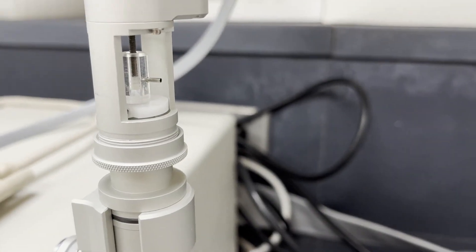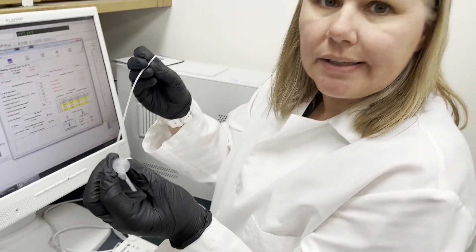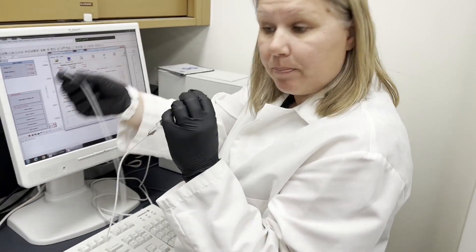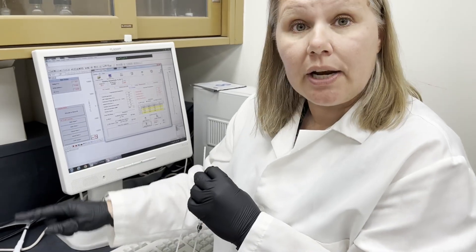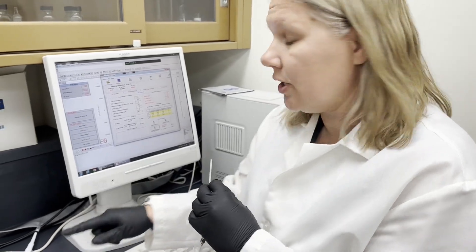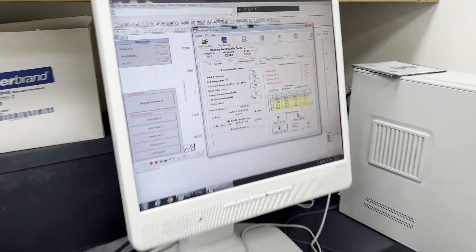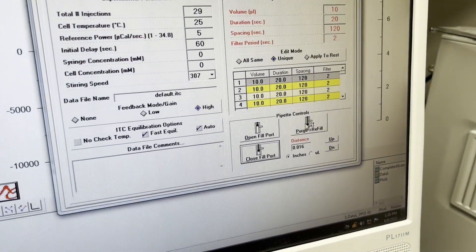If your sample is precious, which most likely it is, you can recover it by putting this back into an eppendorf or something. But to make sure there aren't any bubbles in the injection syringe, what you want to do is hit the purge refill button. So what this will do, it will push that teflon plunger down.